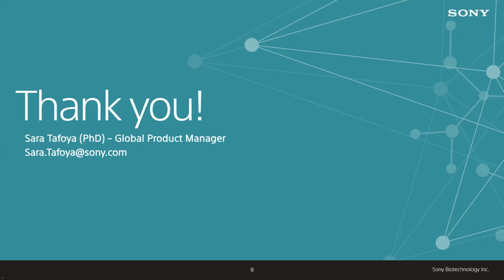Great. All right, our next question here for you, Min, says, considering the complexity of the tumor microenvironment, how did you ensure the accuracy and reliability of the sequencing results? So that's a good question. So first thing, in this case we try to only focus on the immune cells. So when we sort, we actually get rid of the non-immune cells such as epithelial cells, and then when we did the sorting, we also did a panel flow.